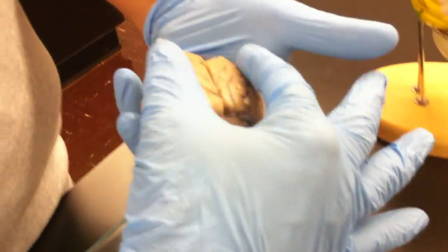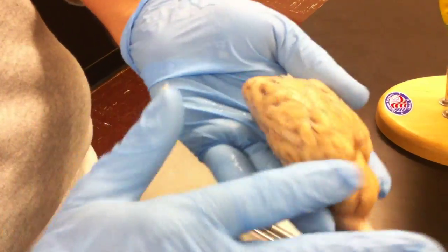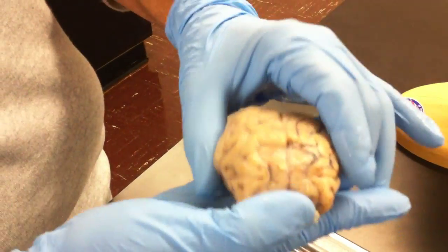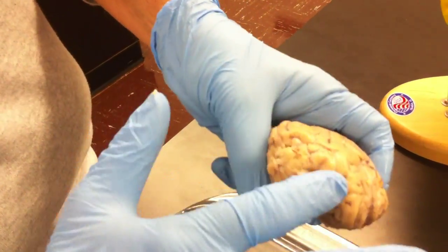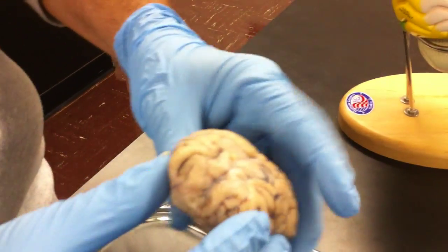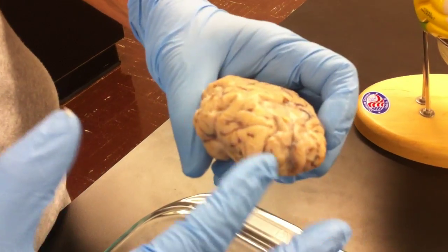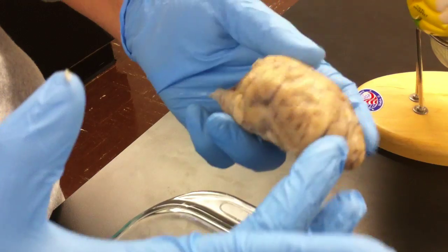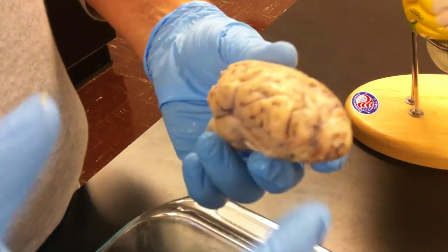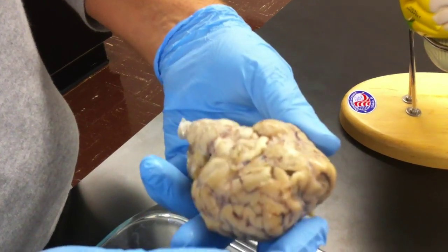Here on the sheep is the cerebrum, and you see the convolutions in it, and you know from your reading what the terms are that are used for the valleys and the ridges. And this is the frontal part of the brain. This is the part of the brain that was damaged in Phineas Gage, in our journal club, by the railroad accident.